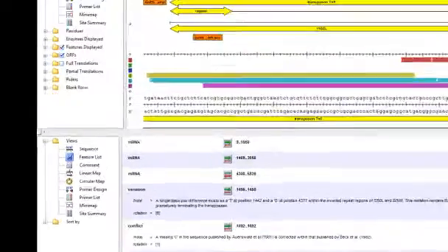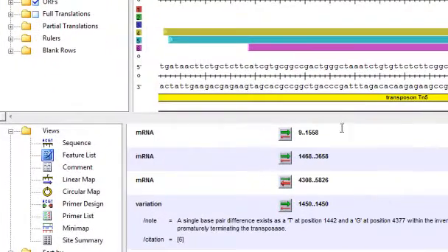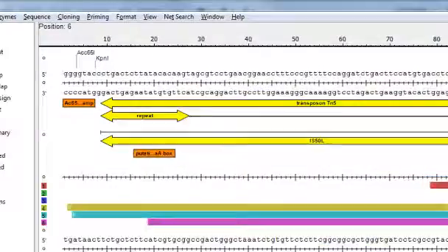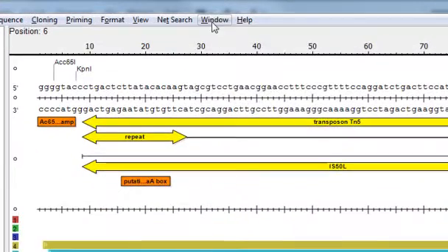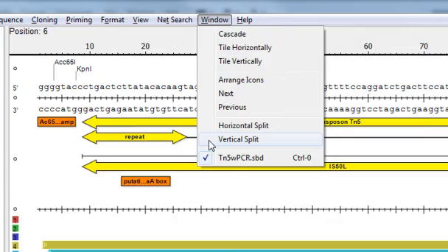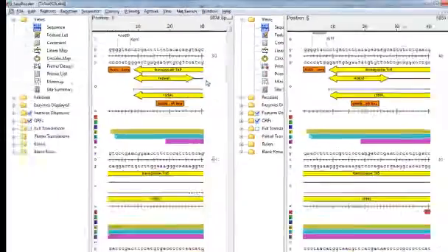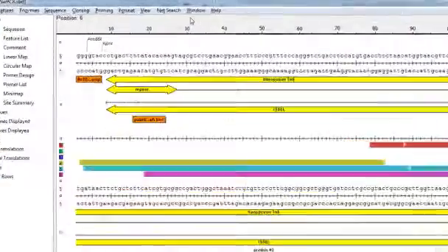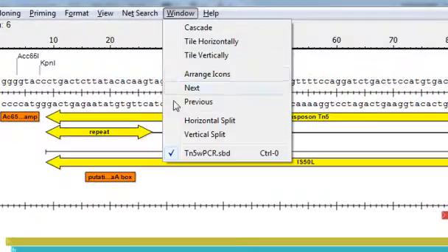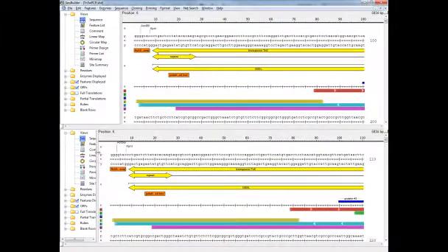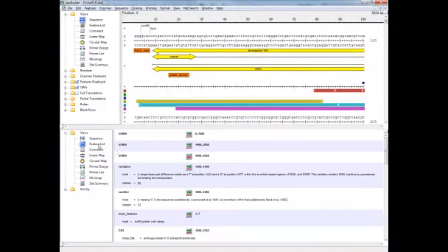To remove a pane, you just double-click on the divider bar like this. If I'd like to add one back, I can select Window Vertical Split to add a vertical pane, or Window Horizontal Split, which will add another horizontal pane.